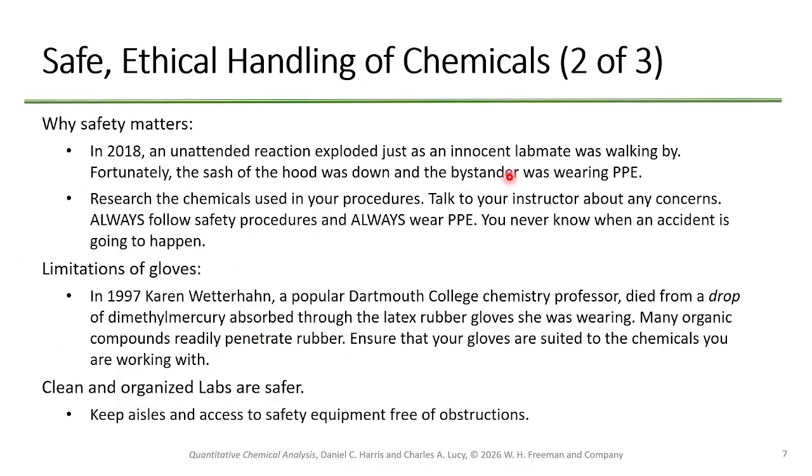there are so many examples of unsafe lab procedures. Did I ever tell you guys about the graduate students at California that killed themselves? Have I ever told you about selenium labs? There are certain compounds that burn whenever they contact air.